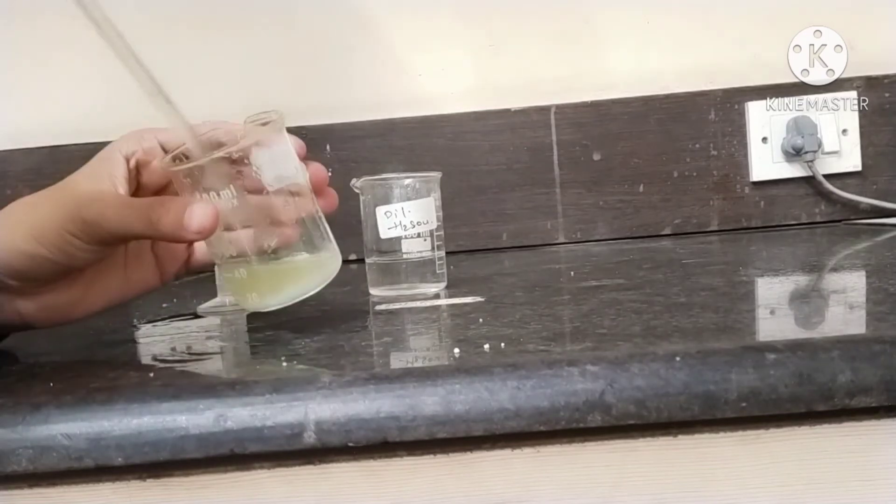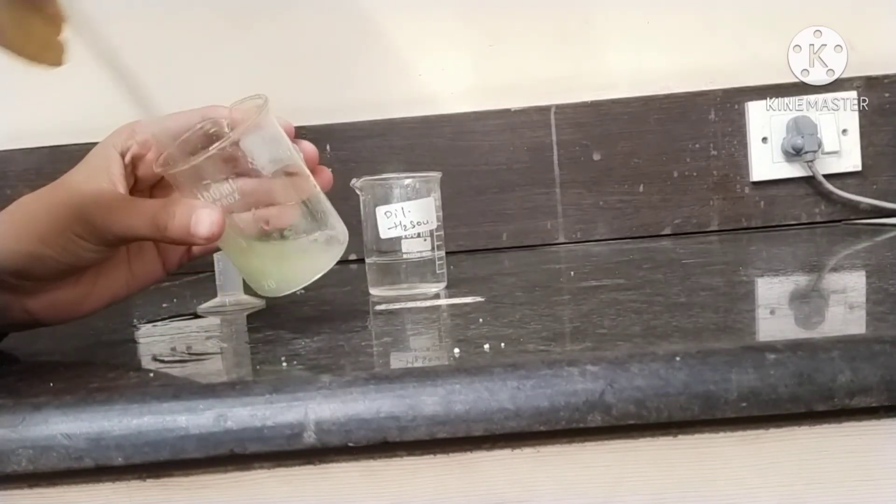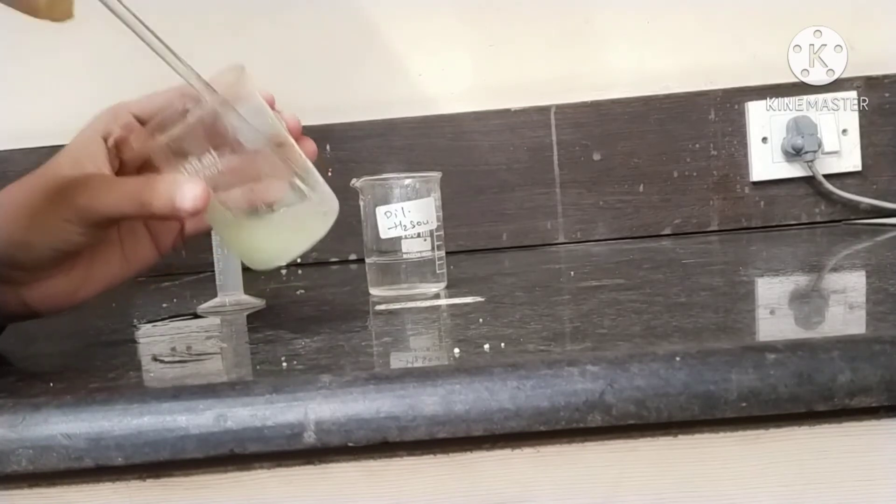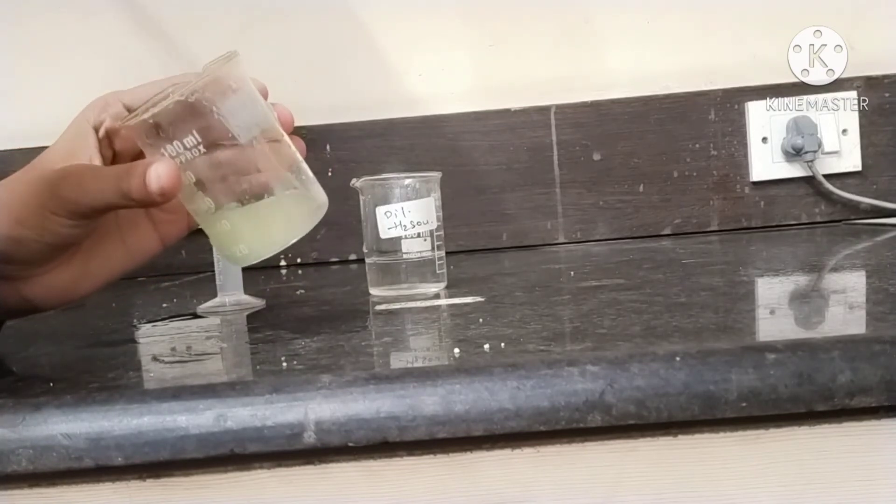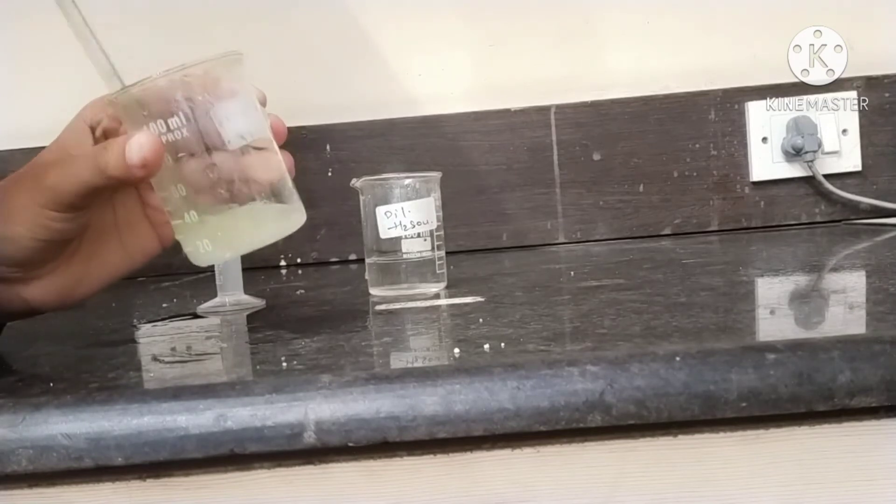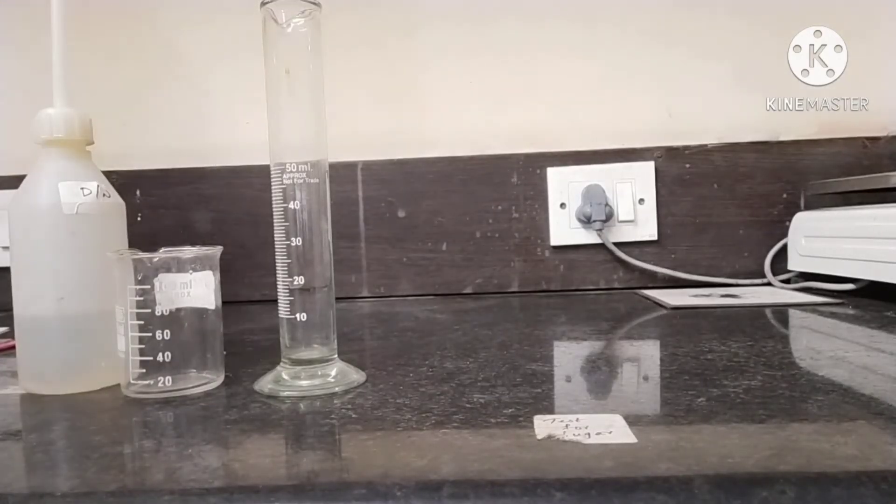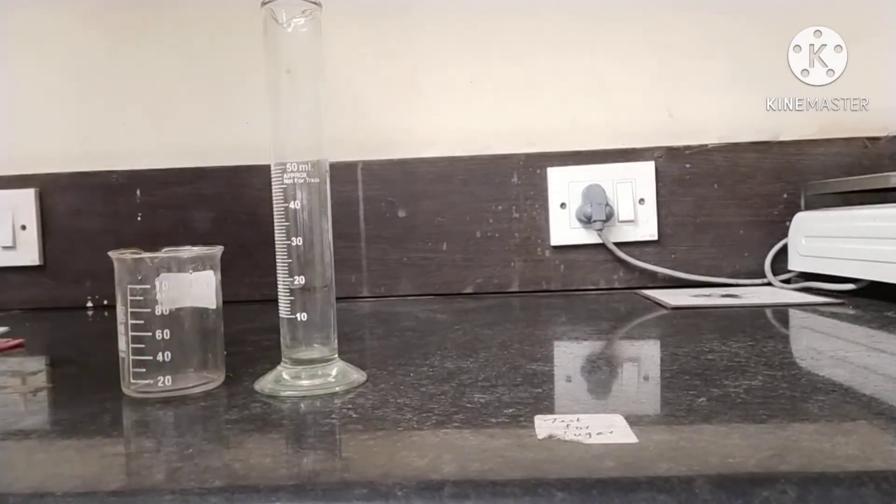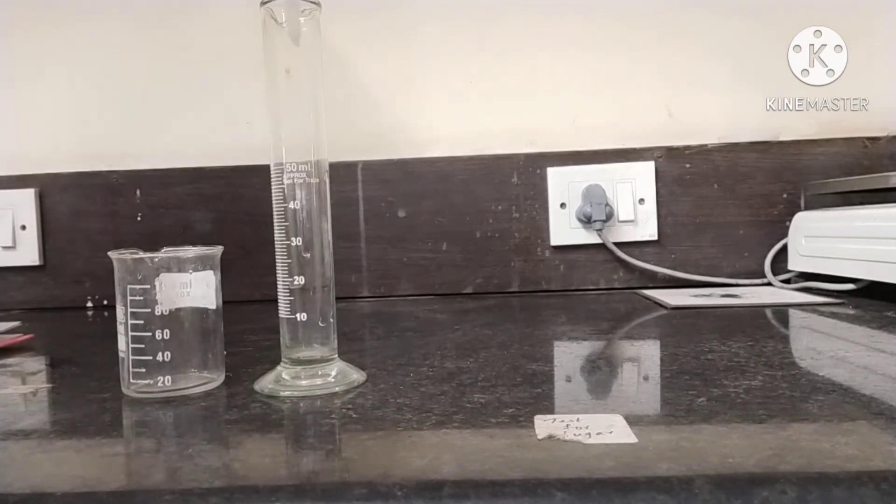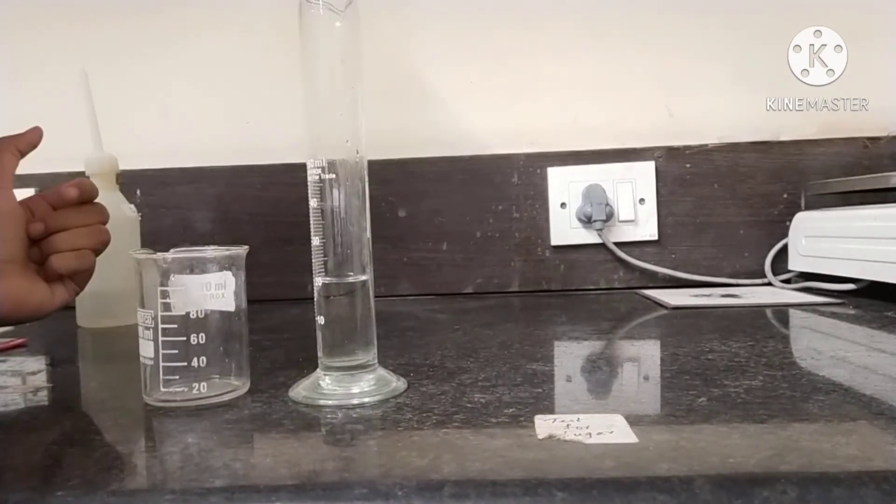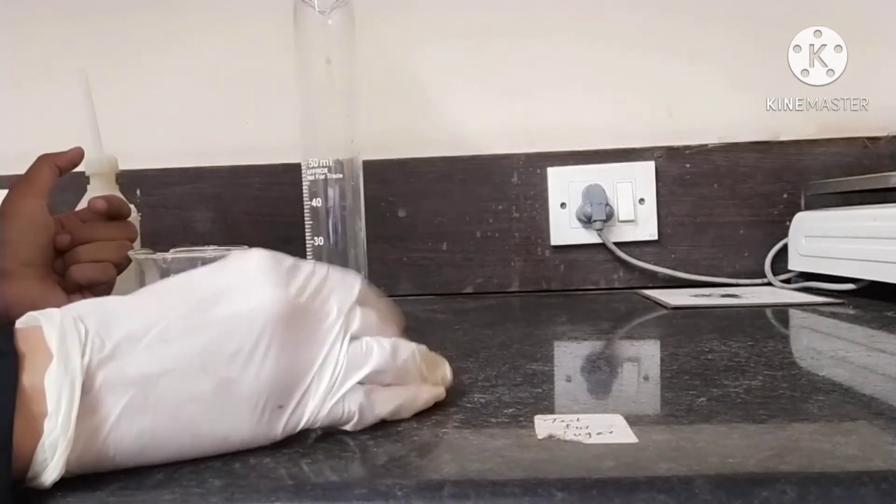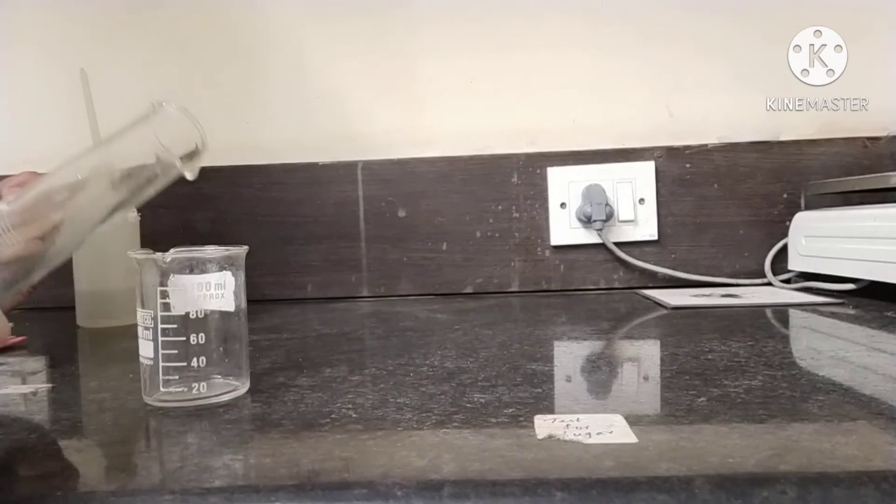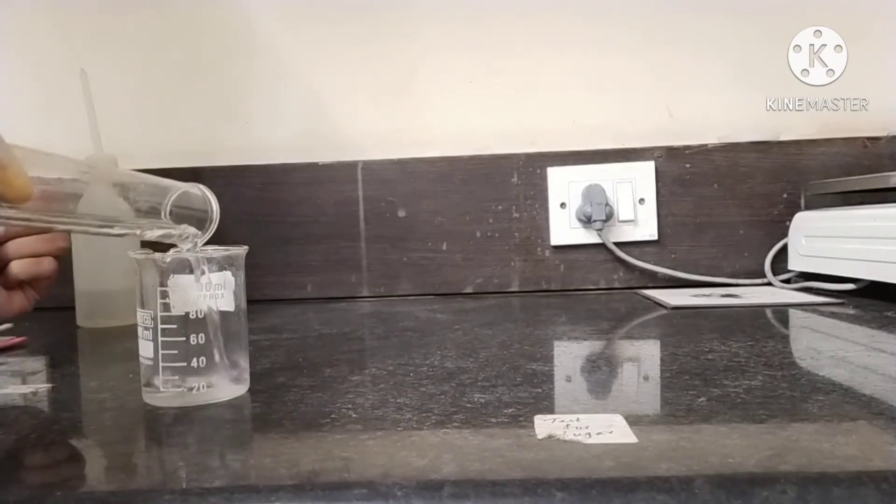Now, with the help of a glass rod, stir this solution like this. Now move to the next step. Take a small beaker and add 20ml of distilled water. Pour 20ml of distilled water with the help of a measuring cylinder into a clean beaker like this.